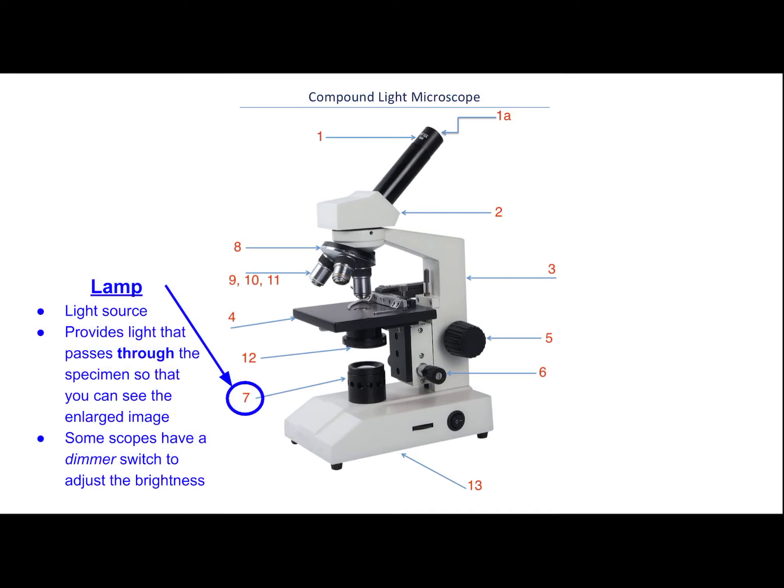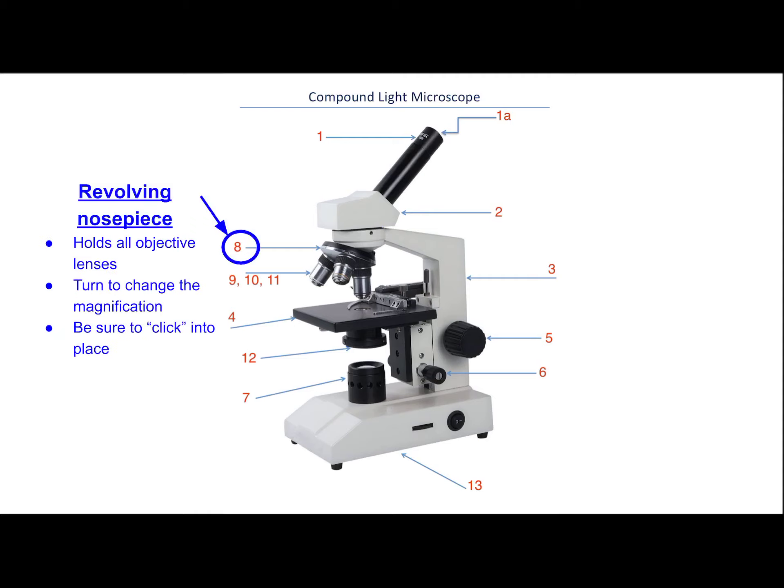Part number seven is the lamp, or light source. This is placed under the specimen and will provide light that passes through the specimen and into the lenses. A compound light microscope uses light to enlarge an image as it passes through the lenses. Some scopes have a dimmer switch — ours do — so you can adjust the brightness of the light passing through the specimen.